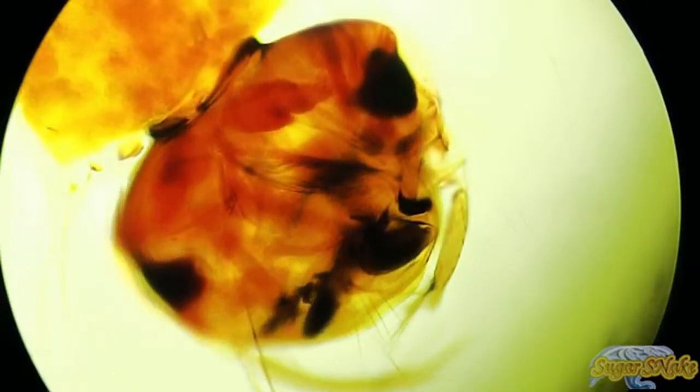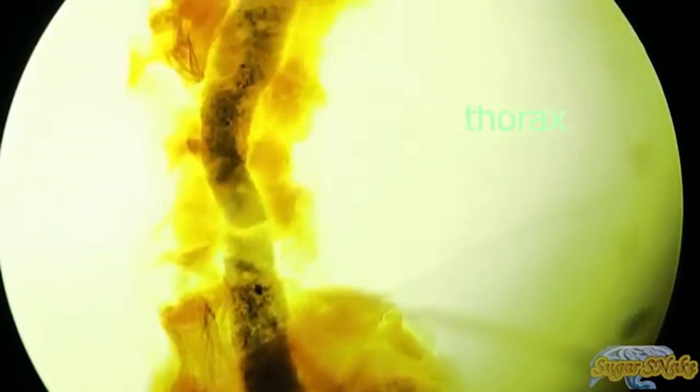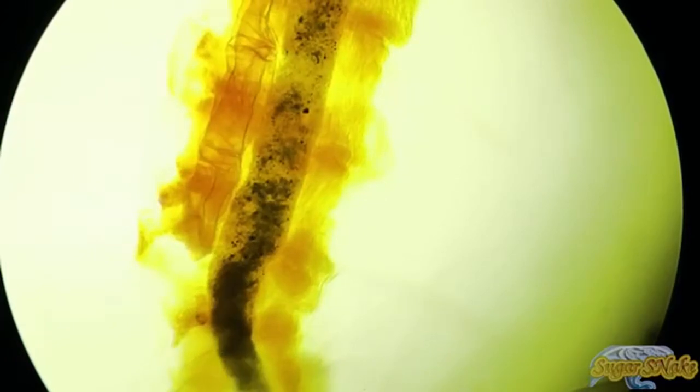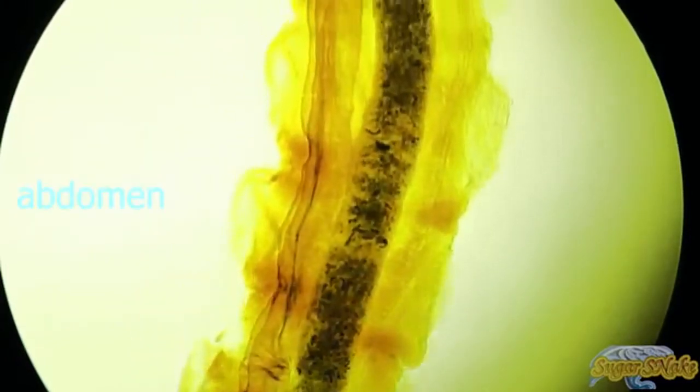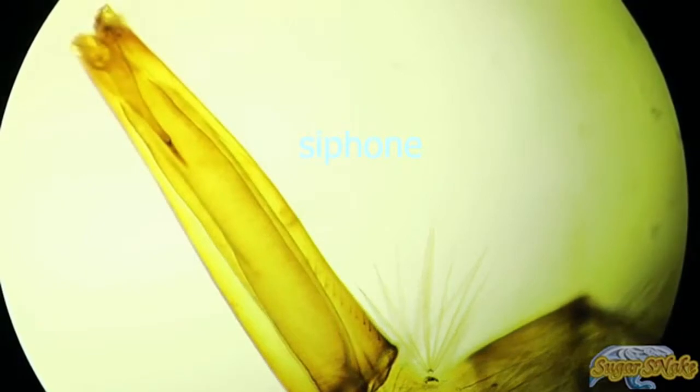The larvae spend most of their time feeding on algae, bacteria, and other microbes in the surface microlayer. They dive below the surface when disturbed. Larvae swim either through propulsion with their mouth brushes, or by jerky movements of their entire bodies, giving them the common name of wigglers or wrigglers.